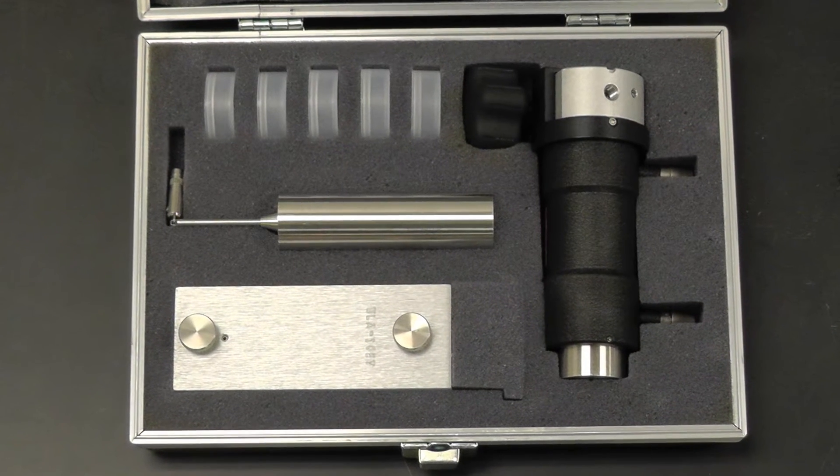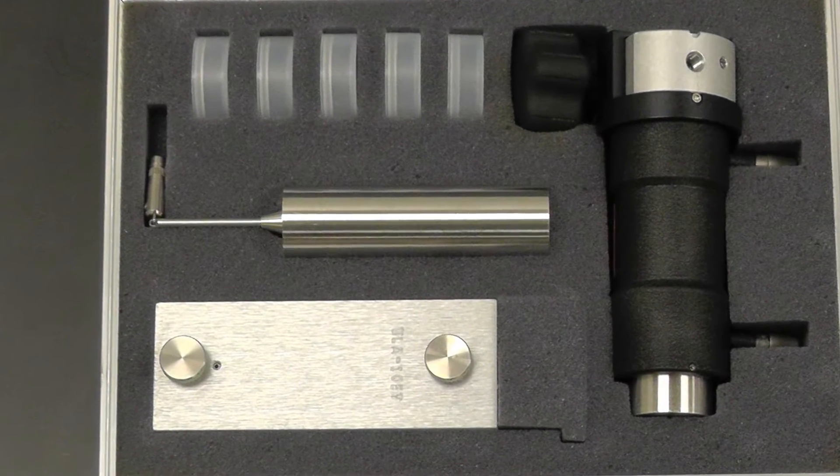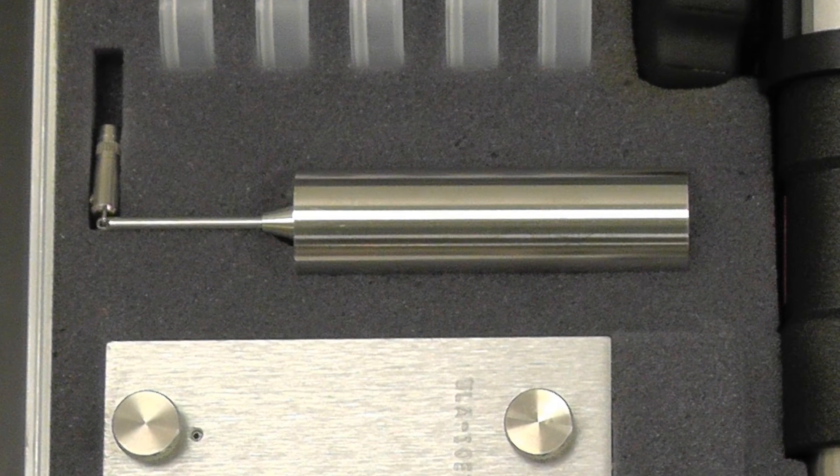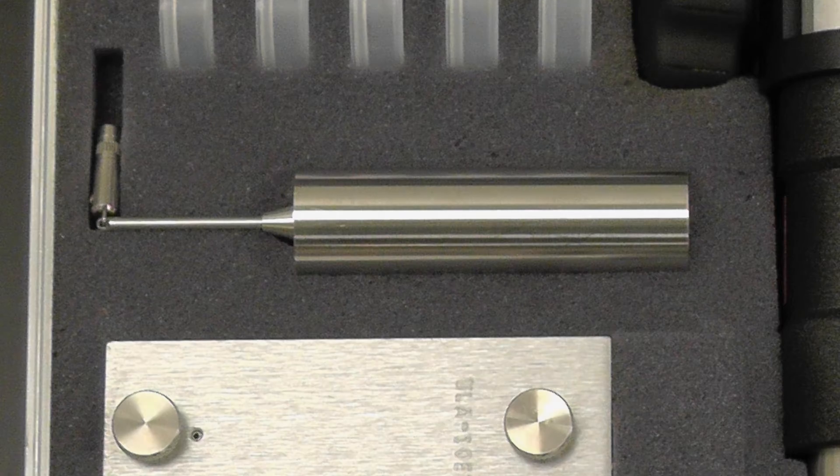The large surface area of the spindle along with a close proximity to the sample chamber wall allows you to get accurate readings on low viscosity materials.